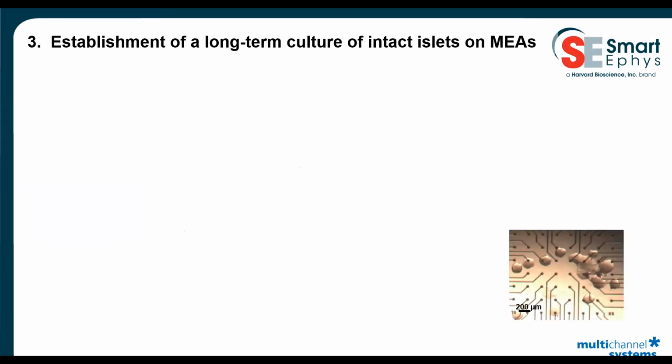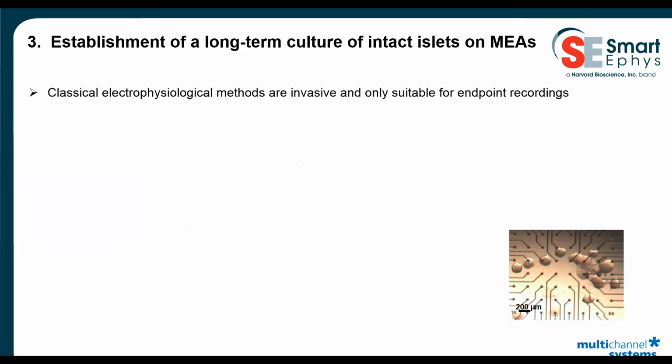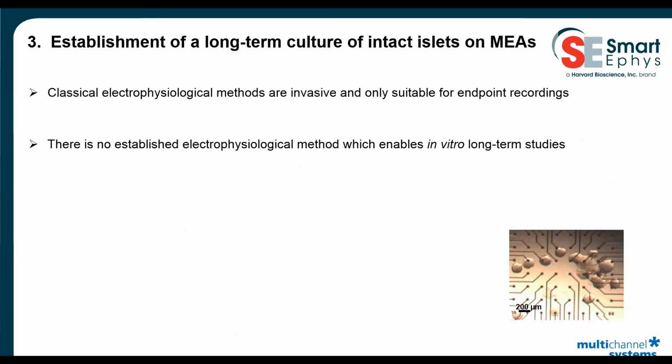Next important milestone was the establishment of long-term cultures of intact islets on MEAs. And the reason for that was that classical electrophysiological methods are, as I mentioned already, invasive and only suitable for endpoint recordings. And it is a fact that there is no established electrophysiological method which enables in vitro long-term studies.